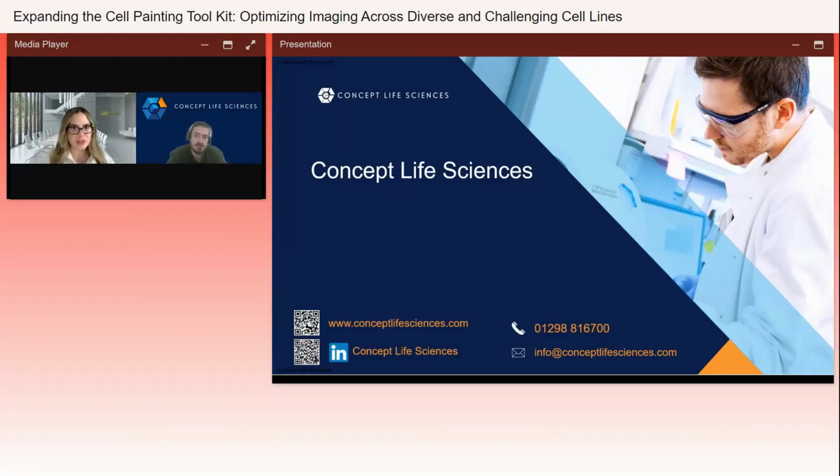All right. This next one that we have says, how do you determine which previously untested cell lines are viable candidates for cell painting studies, especially in early phase drug discovery?